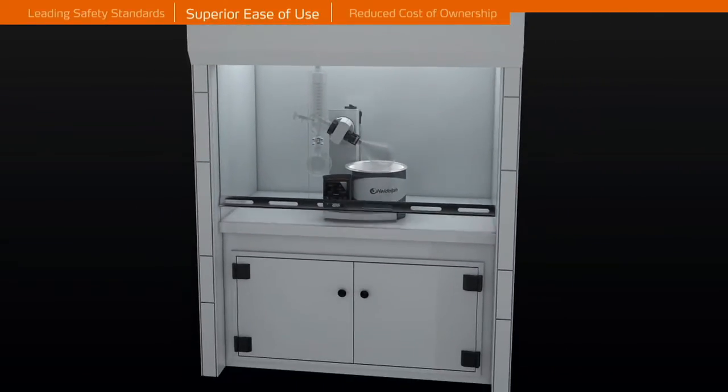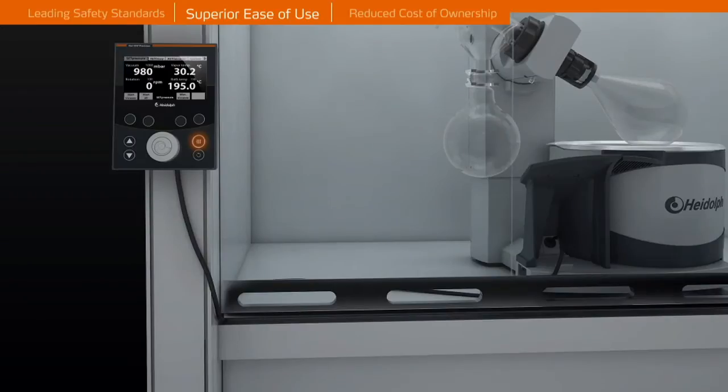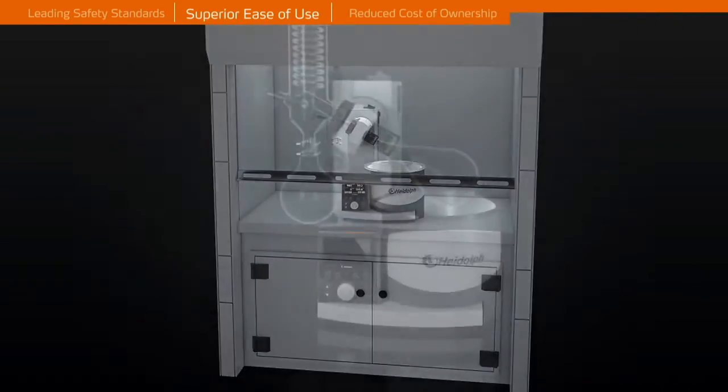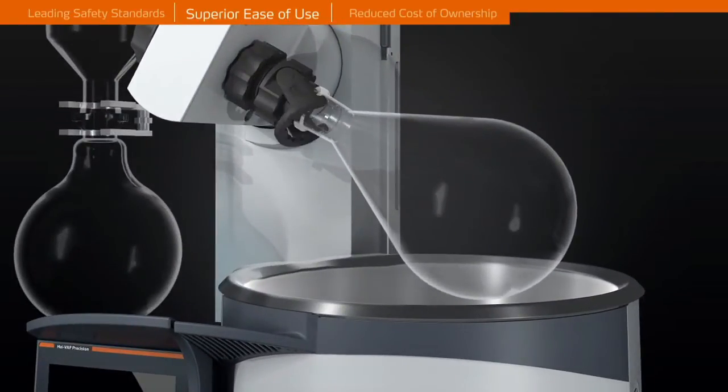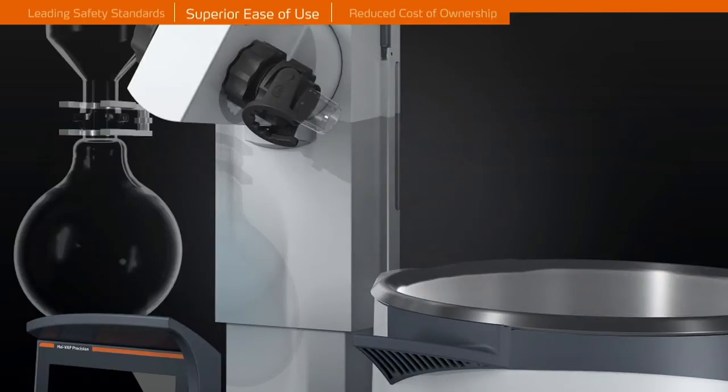Convenient and safe operation from outside closed fume hoods — the unique detachable panel makes it possible. The 210 degrees Celsius heating bath accommodates even up to 5 litre flasks as standard and increases your application range.